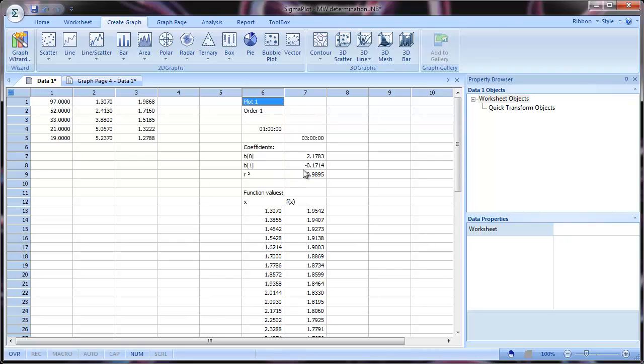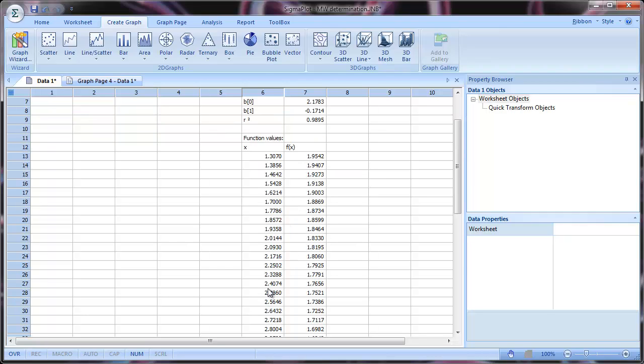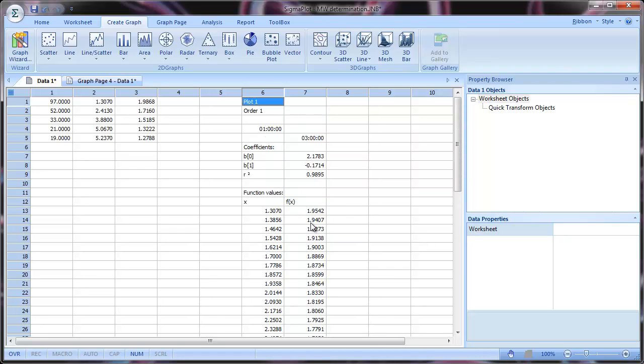And more important yet is our line coefficients, the slope and the b and r squared values. So with this data, we can calculate any molecular weight, and from these values, we can have a rough idea without calculating.